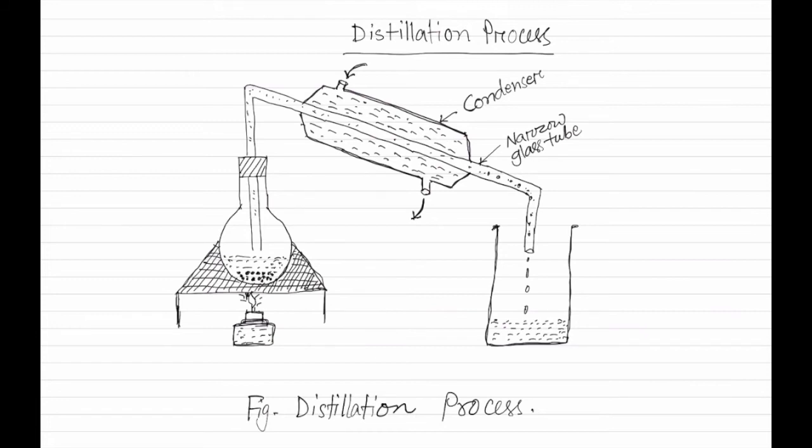Another spherical flask, or you can say a beaker or a flask. It's a flask that contains distilled water. This water is generally known as distilled water.